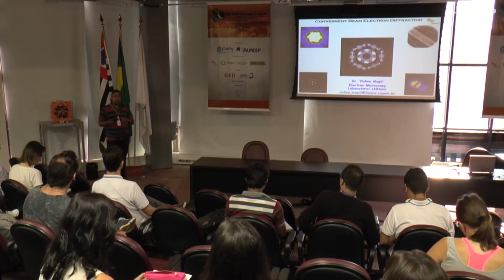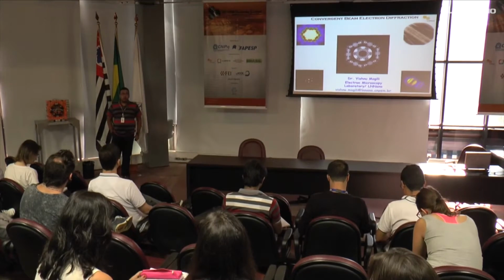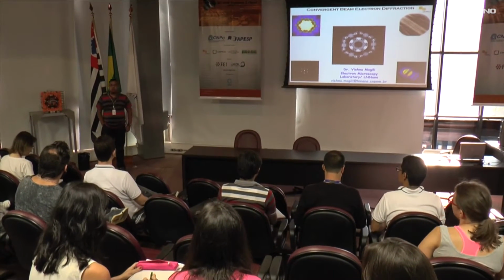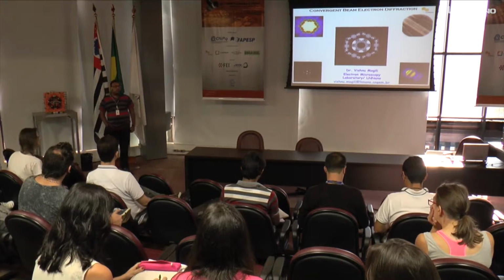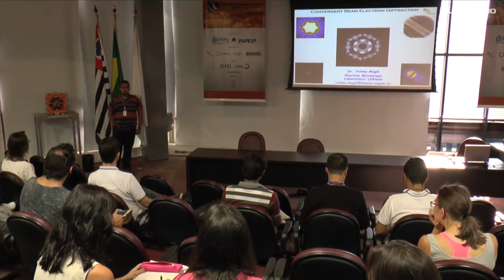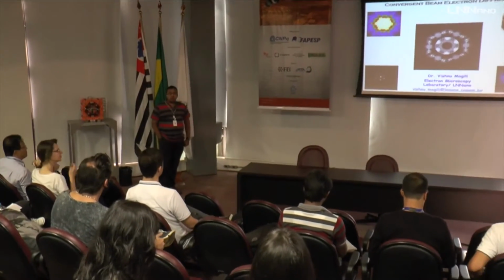So welcome back, folks. Welcome to the second week of TEM School 2016. I hope you had a good break from your first week of TEM School. In this week, we'll be hearing some advanced topics in electron microscopy. The first one will be convergent beam electron diffraction.